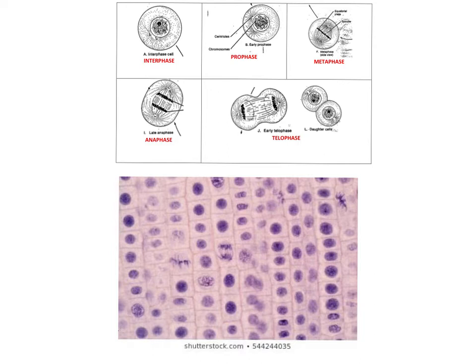For this activity, you will need to scroll to the end of the mitotic index activity and find the image that corresponds with your first name to see which image you were assigned to. So I have my image here, which is not one of the choices, but I'm going to do this as an example so that you can identify what you're supposed to do with your image.